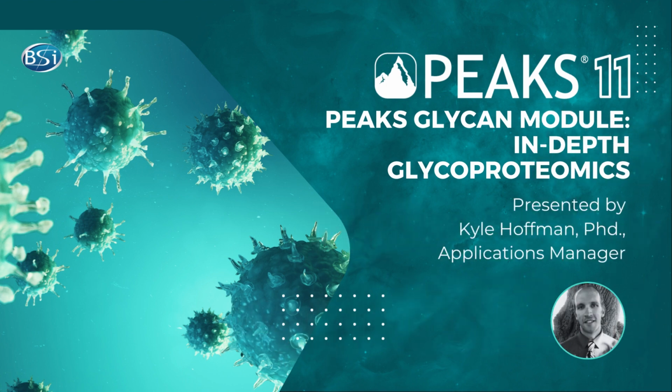Okay, thanks, Zach. And thanks everyone for joining today for our last webinar. And yeah, as Zach mentioned, I'll be going over the PEAKS Glycan Module within PEAKS 11, which is new to our PEAKS Studio software.